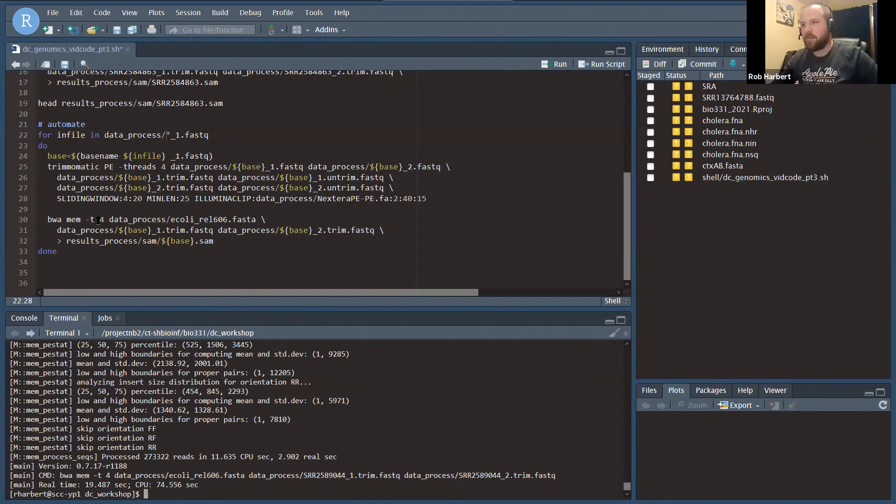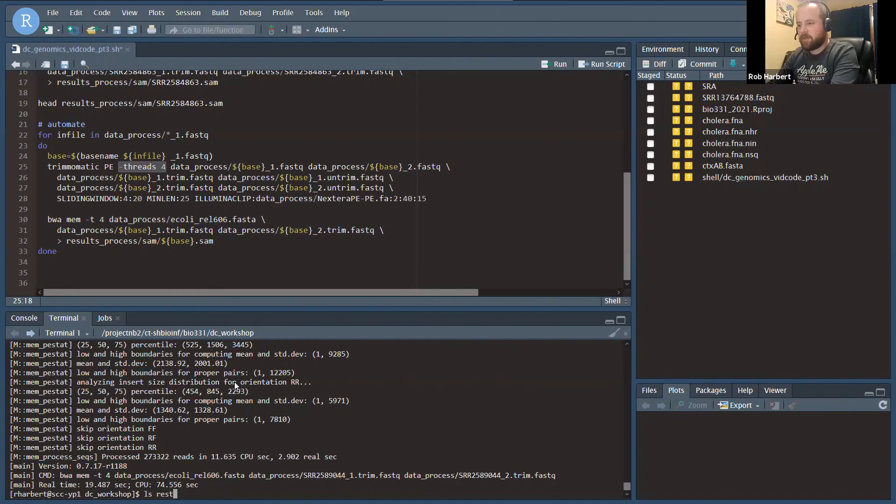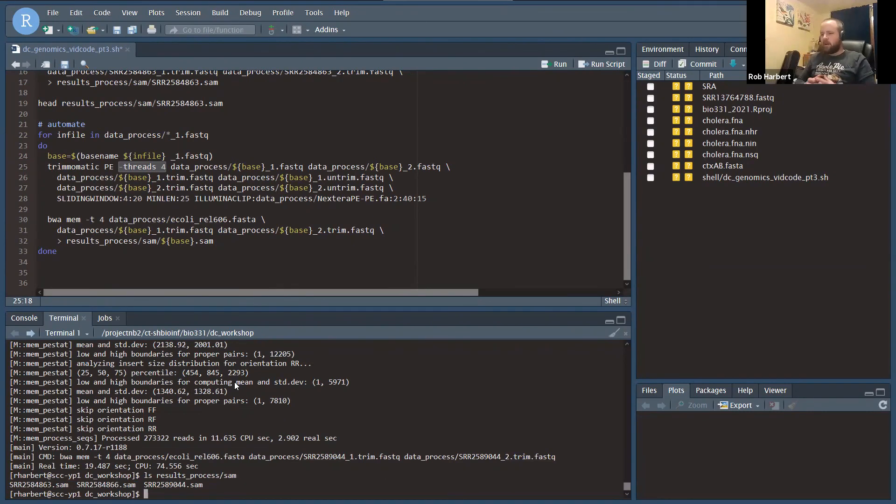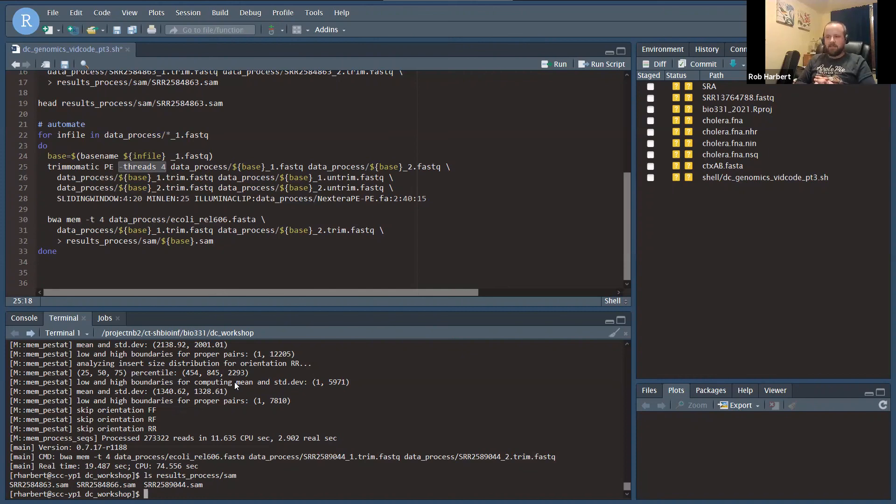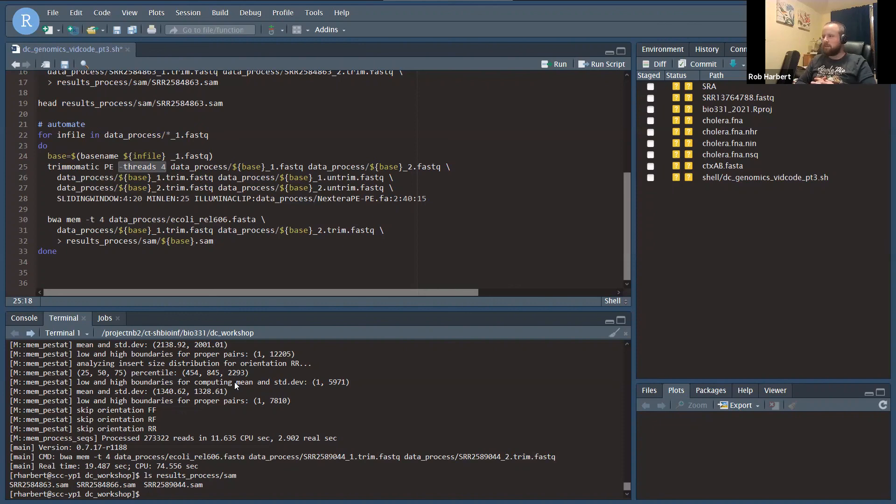Let's just verify that results process SAM now has three SAM files in it. There we go. We've now seen aligning with BWA including indexing your reference genome and added that into our automated workflow with this for loop. Next time we're going to look at SAM tools and some of the downstream analysis to identify variants in our samples.